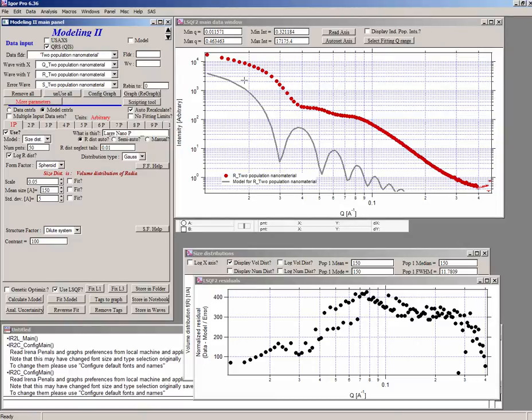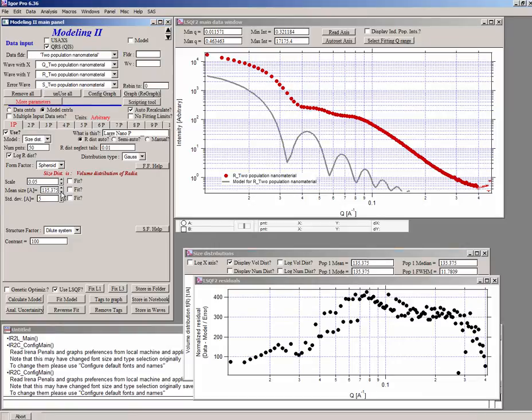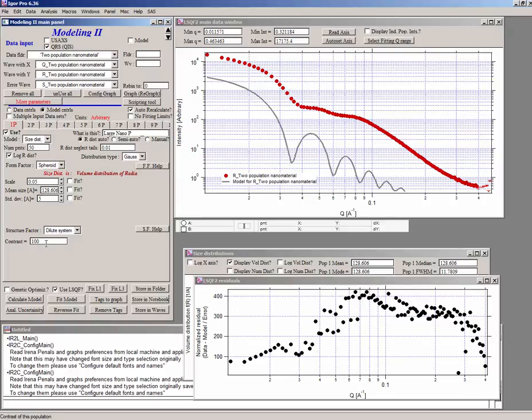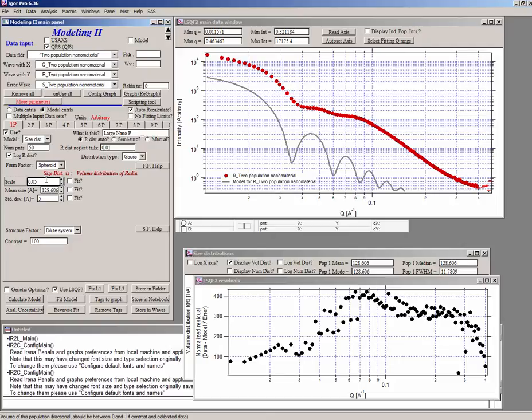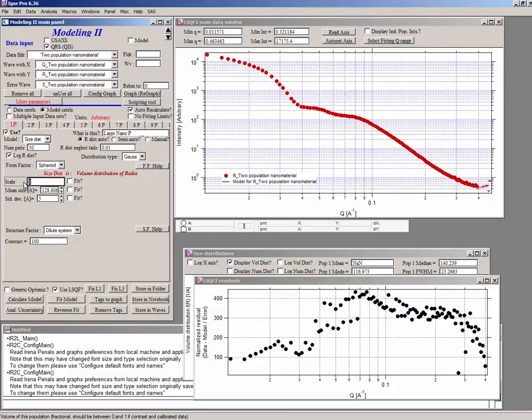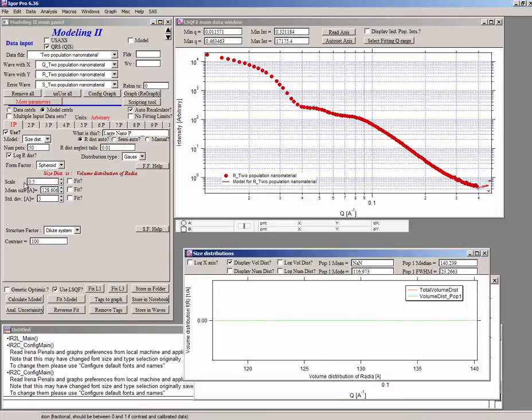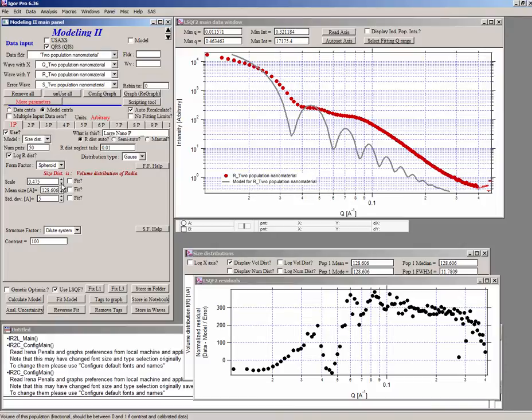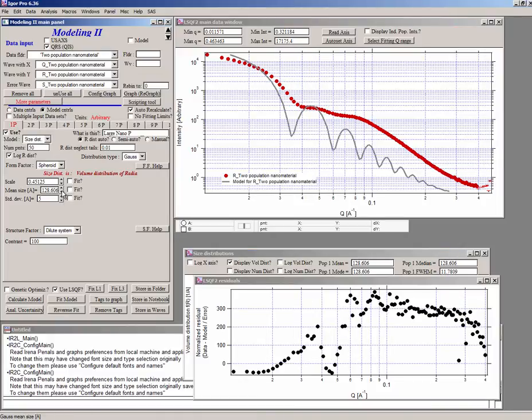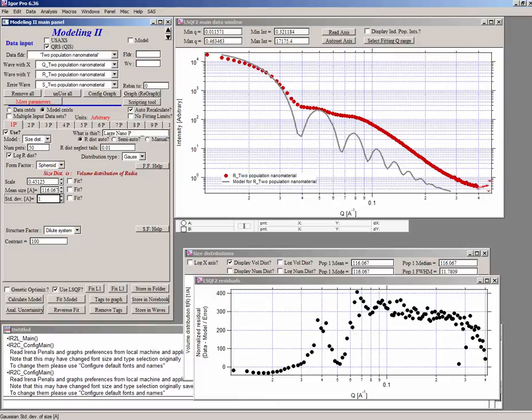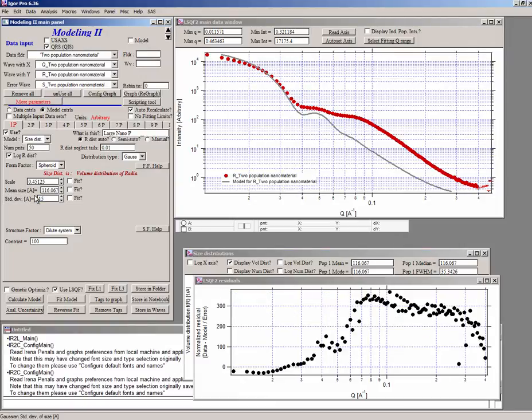So now what we have is we have 150 angstrom particles. And you can see that they are slightly shifted to lower Q. So what that means is that we can probably make a few steps to smaller sizes. So somewhere out here. Now the other thing is these data are arbitrary scale. So we have a contrast and we have a scale. The scale would be like a volume fraction. But that's only volume fraction if you have data on absolute scale and you have the right contrast. In this case, it probably doesn't matter. So I'm going to set the value here to 0.5 or so. And we can change that again.